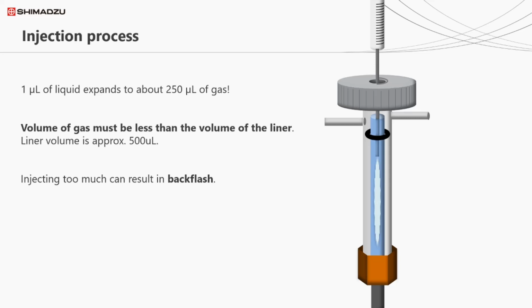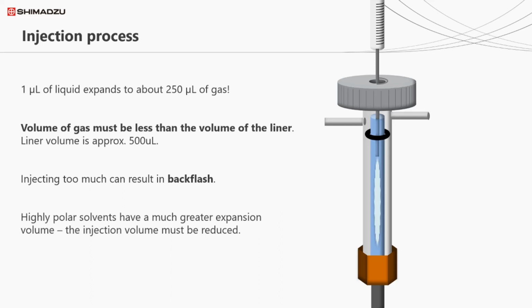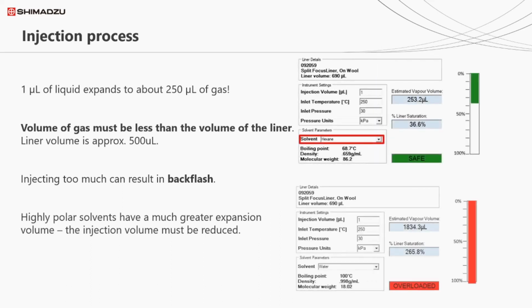body. Whilst the inlet is heated, these gas lines are not, so your sample can begin to condense inside these pipes. This lost sample can cause a host of problems, from ghost peaks, blocked pipes, to damage of critical electrical components. This is one of the most common mistakes made when using GC. Sometimes the analyst is trying to boost the sensitivity by increasing the injection volume, and doesn't consider the expansion coefficient of the solvent being used.